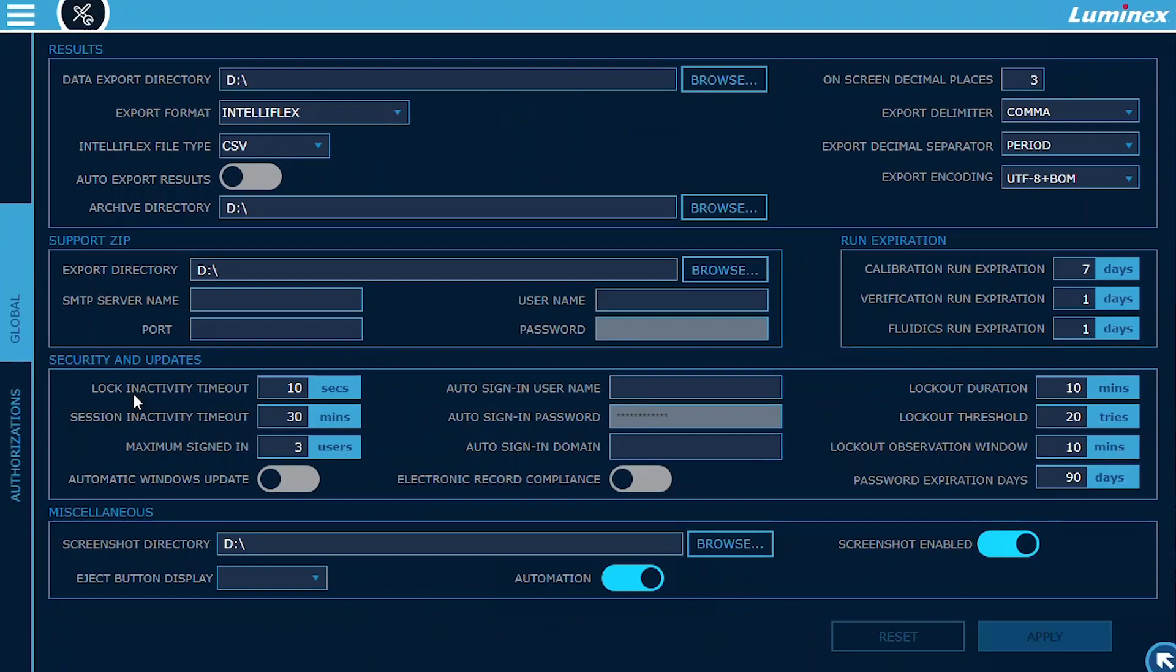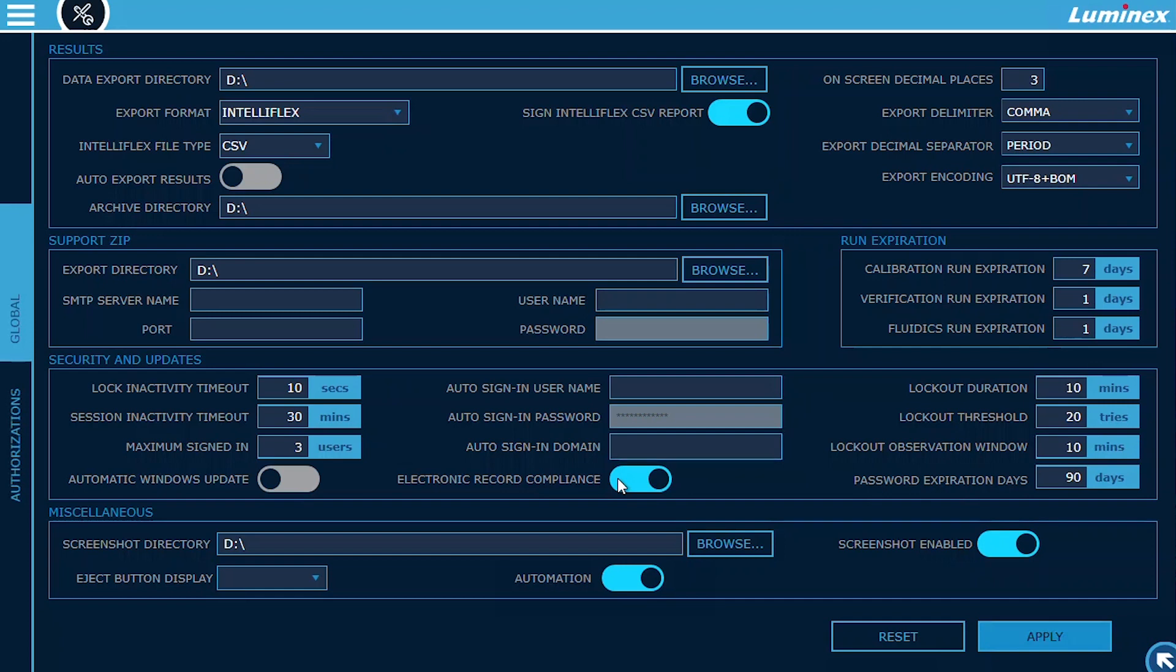The XMAP IntelliFlex Software Version 2.0 introduces an optional electronic records compliance module, which provides functionality that enables users to meet their electronic records security and traceability regulatory requirements for 21 CFR Part 11 or Annex 11.